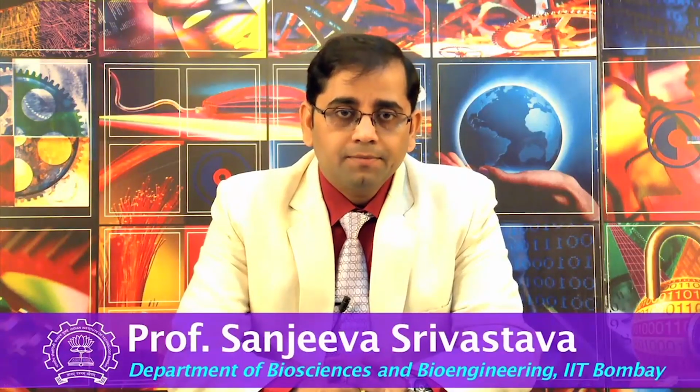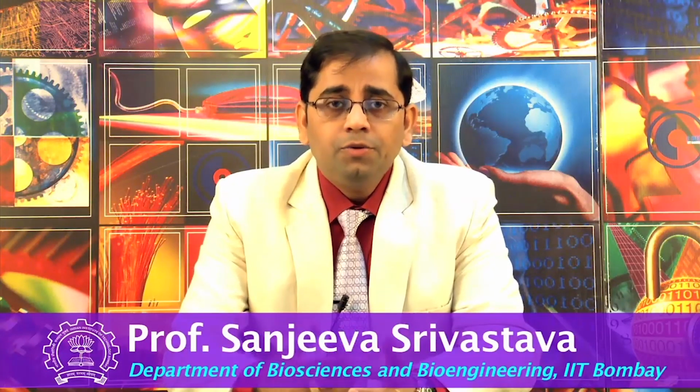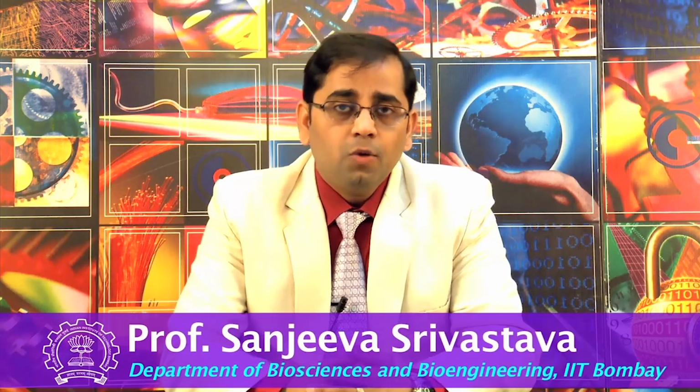In continuation of Dr. Umani's previous lectures, where he talked to you about the basics of reverse phase protein arrays, we are continuing to discuss this novel technology platform, RPPA, in today's lecture, where Dr. Umani is going to mainly focus on RPPA analyzer, which is a tool for RPPA data analysis and visualization. So, let me welcome again Dr. Ramesh Umani to continue his lecture and discussion on reverse phase protein arrays.